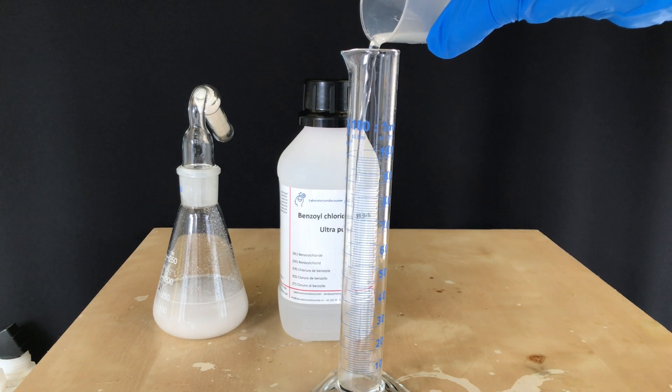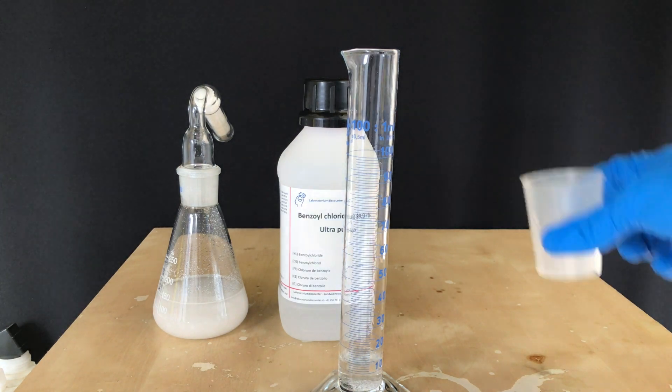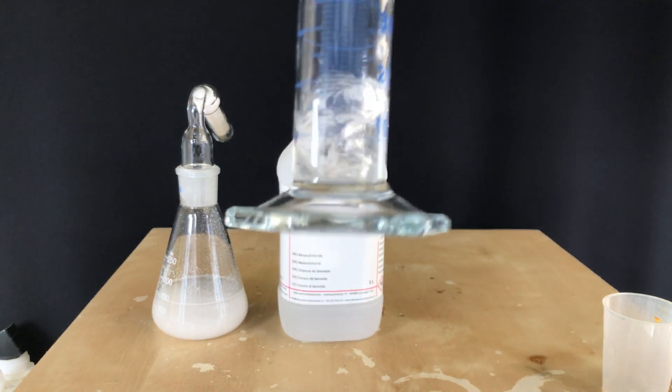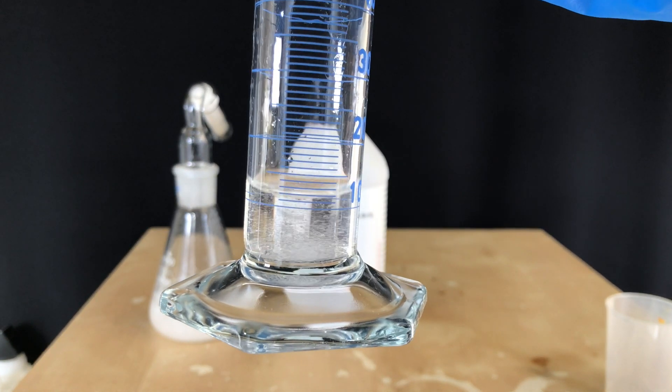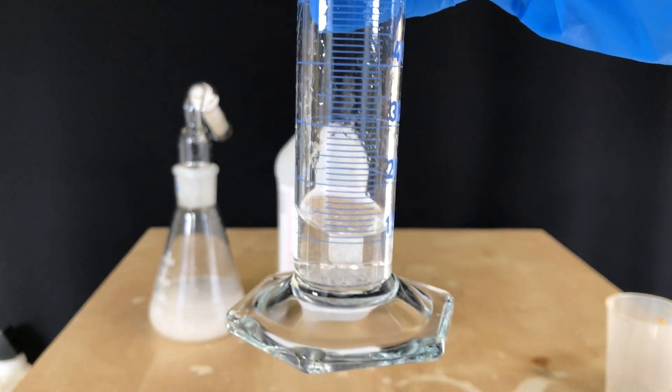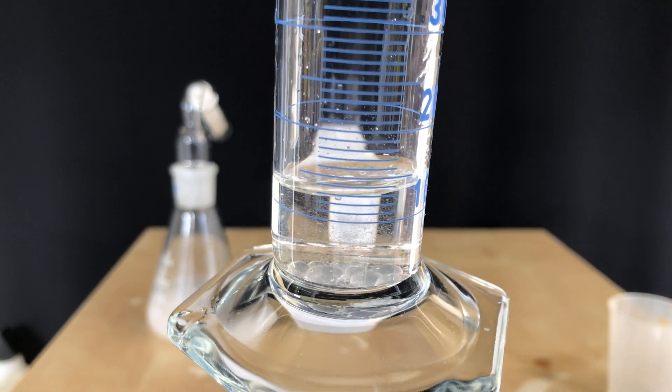Of course there were still a few drops of leftover benzoyl chloride, so I added water to see if the reaction was violent, but nothing happens, not even fumes. When I looked more closely, I was able to see that there are droplets of benzoyl chloride floating around in the water. It's way less reactive than I anticipated.